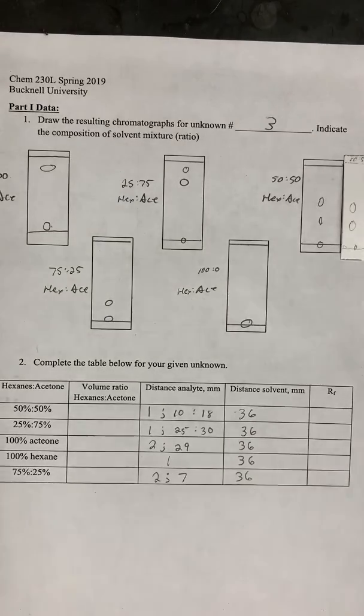All right, so now looking at our data table for part one on the handout that was posted on Moodle, we copied over the data from the five different TLC plates onto this handout.